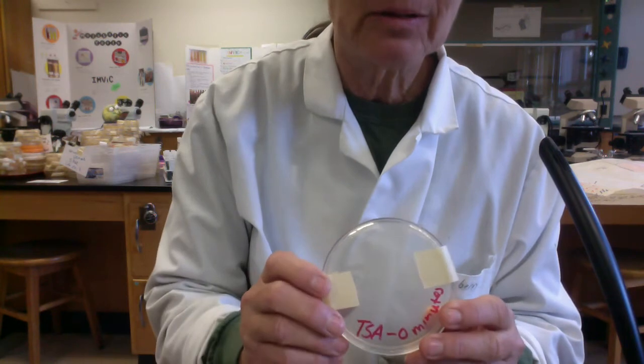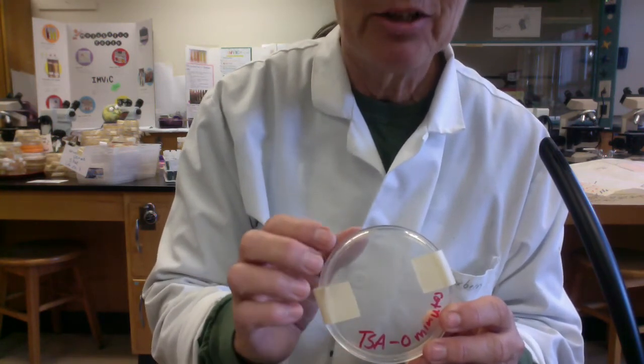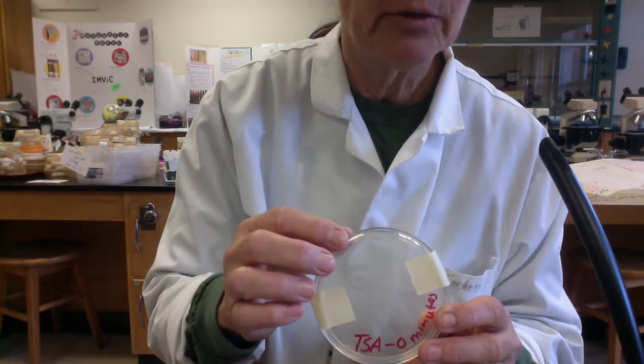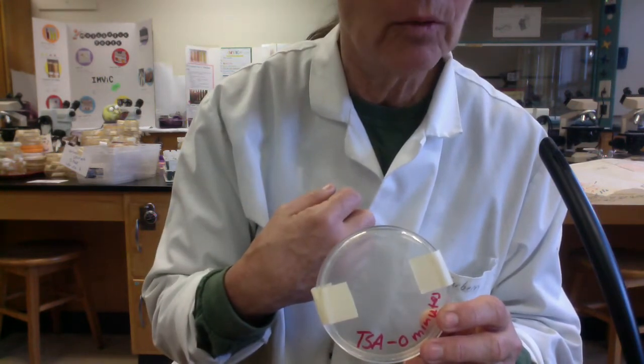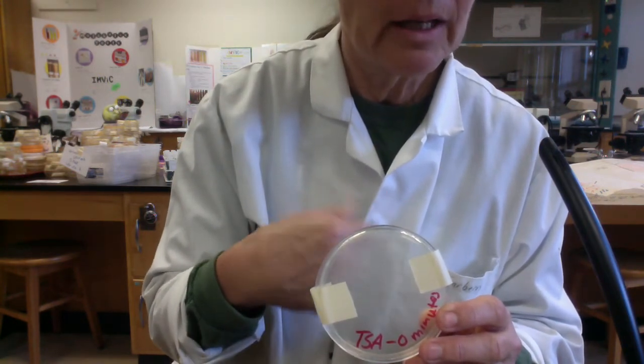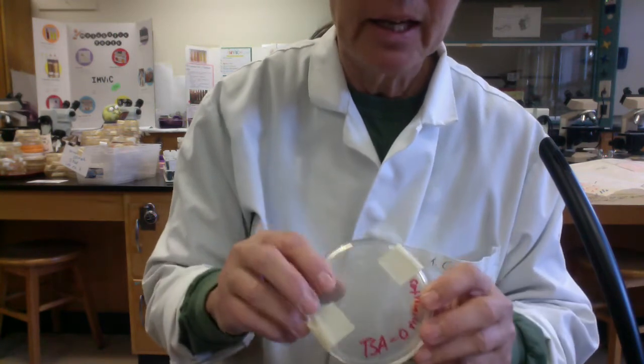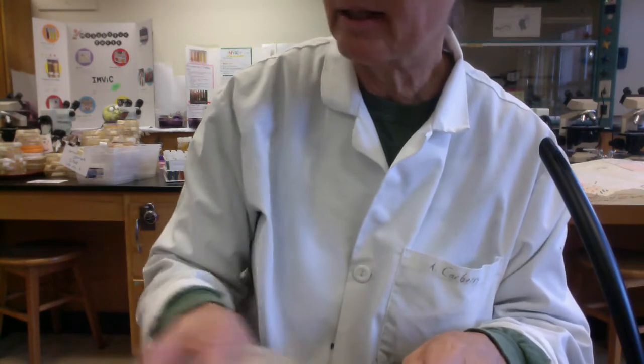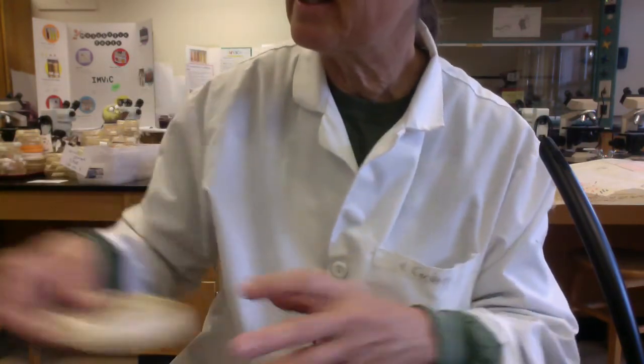Now, my labels aren't complete. I should have the name of the sample, which would be airborne microbes. I want to put my full name or my team number, my lab section, and the date. Okay? And then following incubation, we're going to pull the plates out of the incubator and look at them. And I think you're going to be amazed.